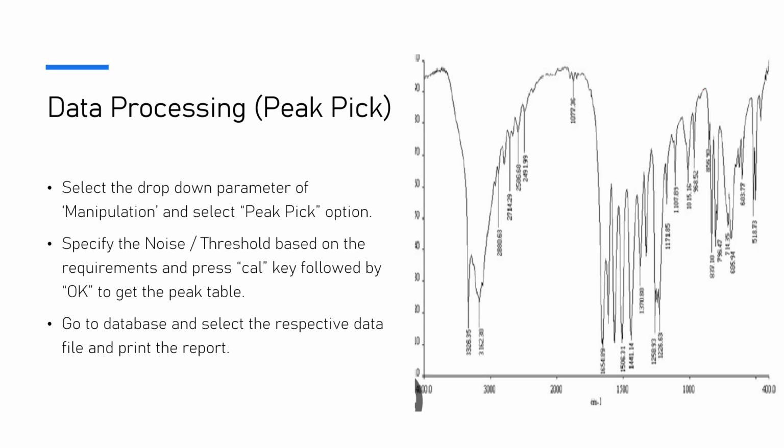Here you can see once you perform your peak pick, your spectra will capture all the wave numbers as per the fingerprints.